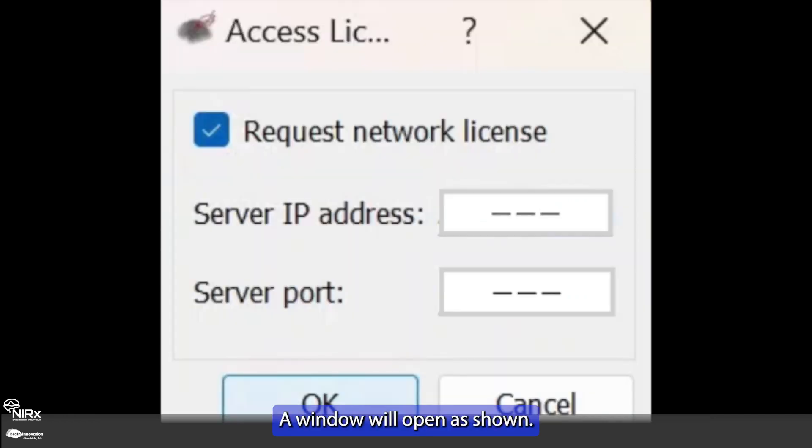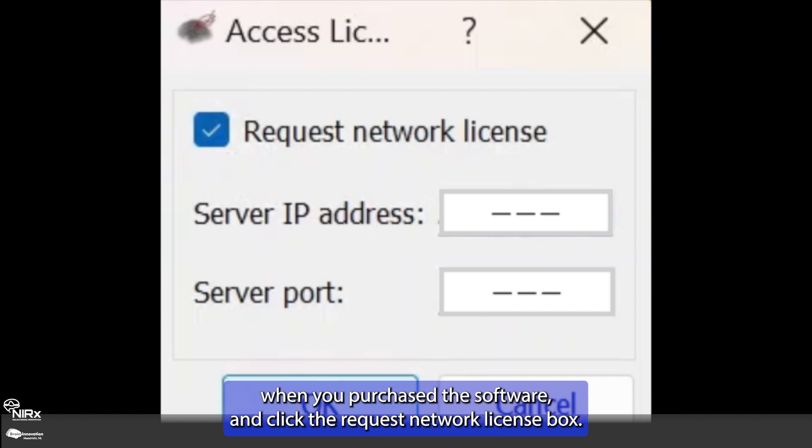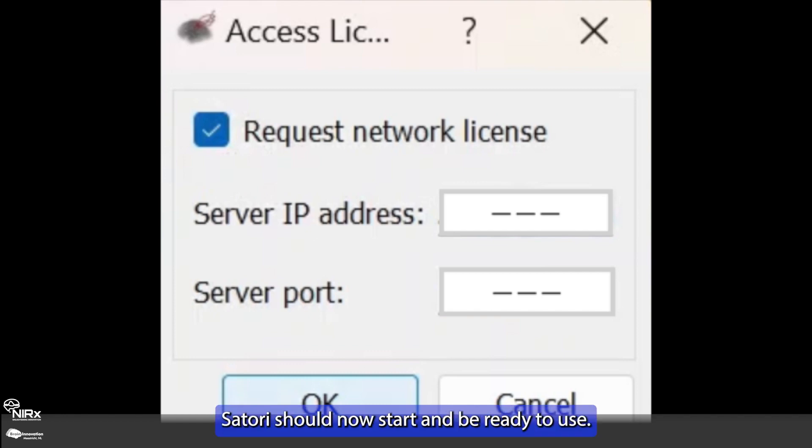A window will open as shown. Please enter the server IP address and dedicated port number provided to you when you purchase the software and click the request network license box. Close the application by pressing OK and restarting Satori. Satori should now start and be ready to use.